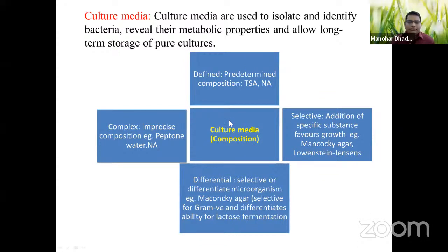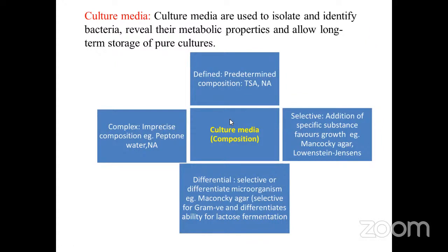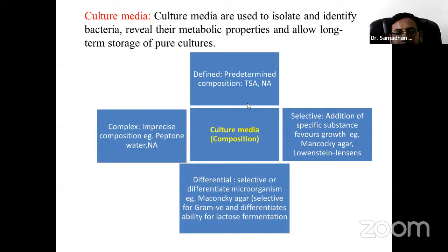Then complex media. The complex media is a mixture of different nutrients, where you don't know the exact composition, like peptone, beef extract, and other complex substances. So their composition is imprecise. Examples are peptone water and nutrient agar also.